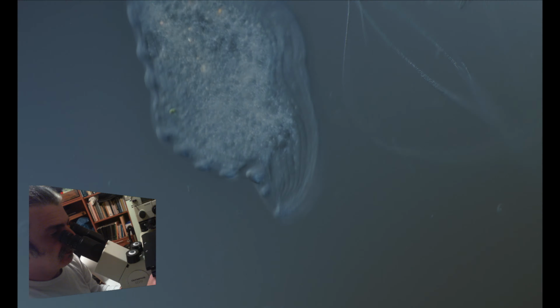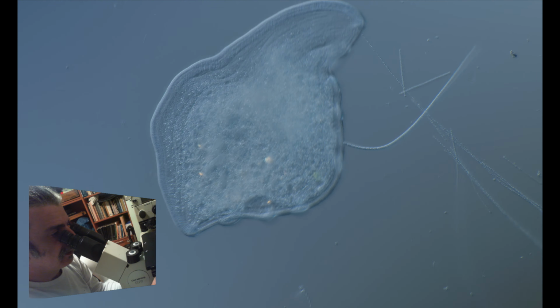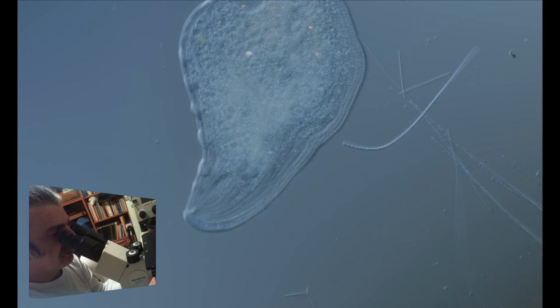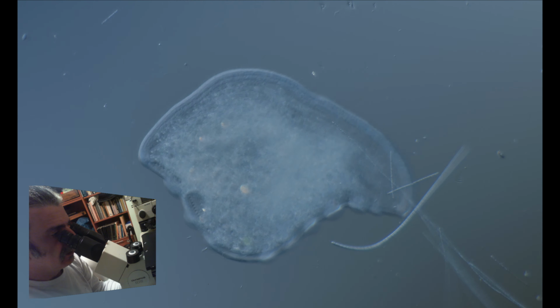Let's look at them in 40x. They're worth it. Magnificent cilia. I'll just adjust the objective a bit. Yes, it's a very nice view of it.